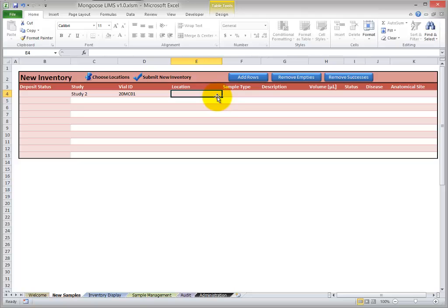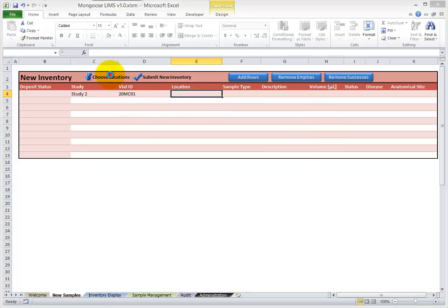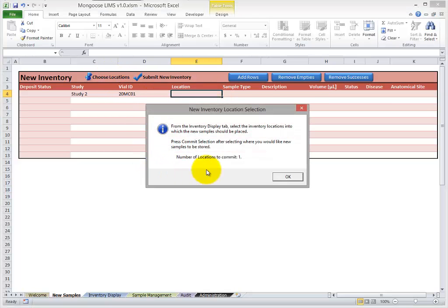That may take a while to type, so that's why we've developed the Choose Locations feature. So how it works: you select the cells for the locations you'd like to specify and click Choose Locations. So it says you've chosen to commit one location. We're going to take you to the Inventory Display tab. You find where you'd like to place the sample and click Commit.